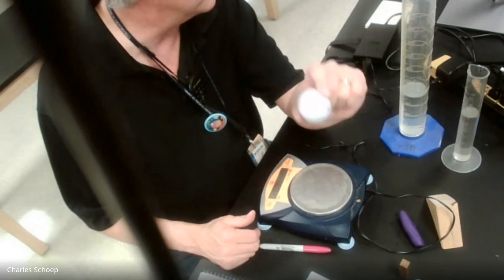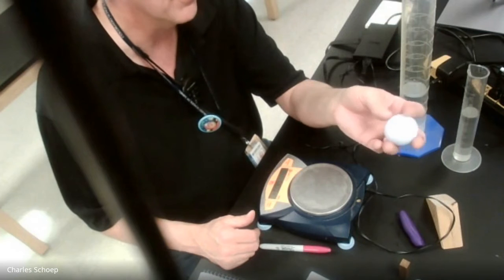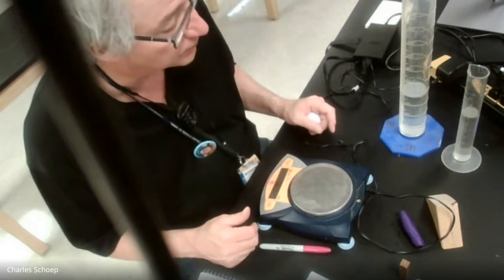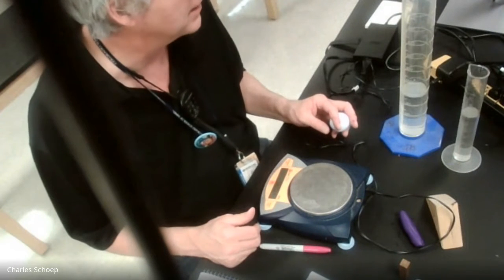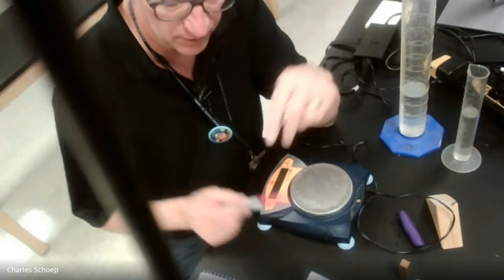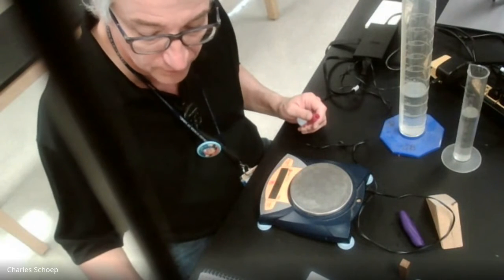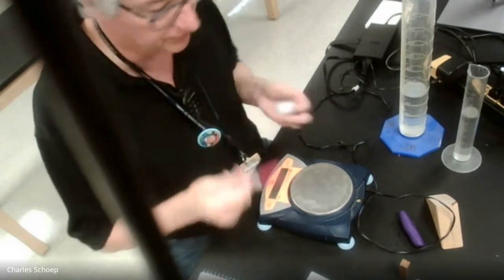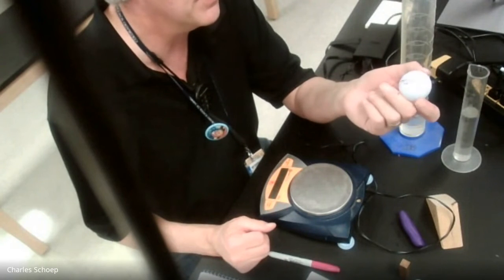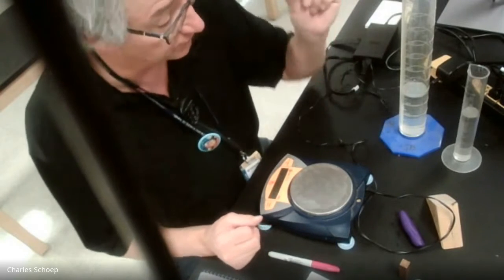There's another way that we could measure volume. We can just displace water or displace a liquid. So the reason why I grabbed my two graduated cylinders here is because I'm feeling a little lazy, and I don't feel like figuring out 4/3 pi r cubed. So I'm going to write down golf ball. And instead of measuring the diameter and calculating the radius and then doing 4/3 pi r cubed, I'm going to do the lazy man's volume measurement.